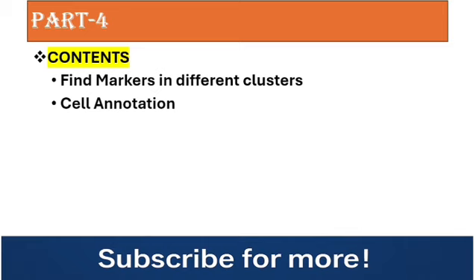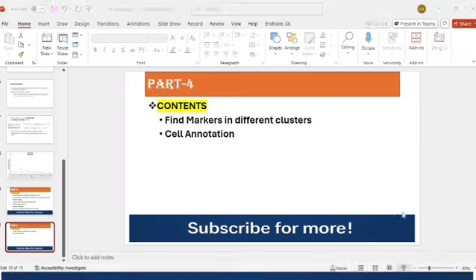And this is the last part of single cell RNA-seq analysis, in which we will learn about how to find markers in different cell clusters and cell annotation. This is the most important part of single cell RNA-seq analysis. Let's learn about it.